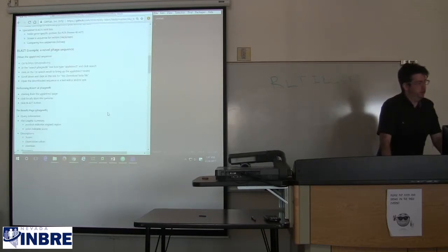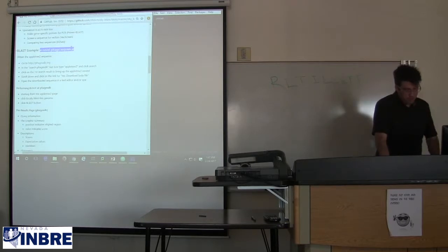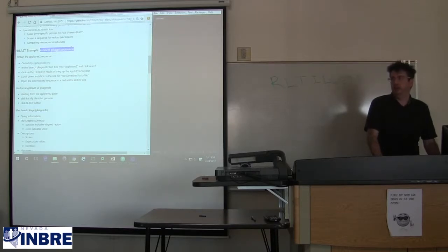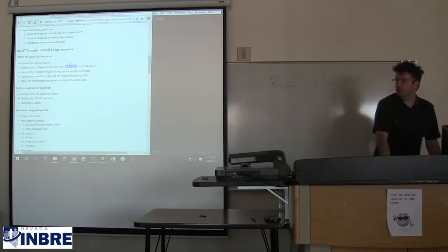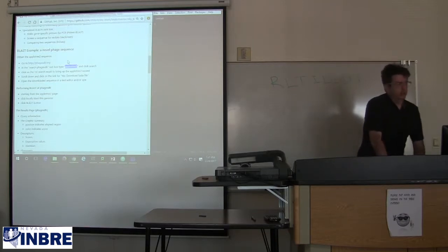And our first example is going to be with a novel phage sequence that actually comes from the 299 Special Topics Lab, Apple Tree 2 from PhagesDB. This was sequenced, Tina, you got this in 2014? Sounds about right. Yeah.